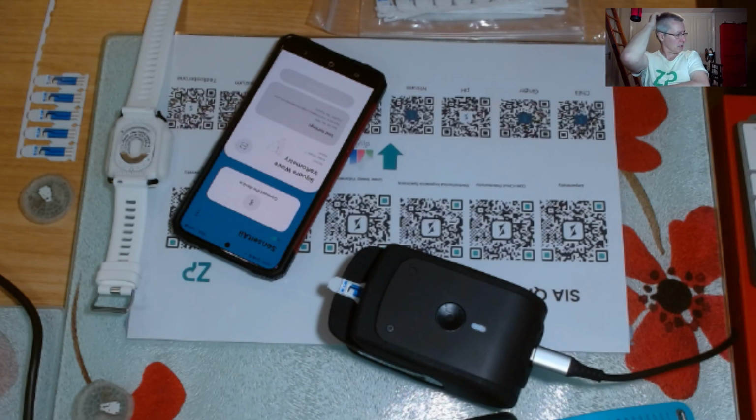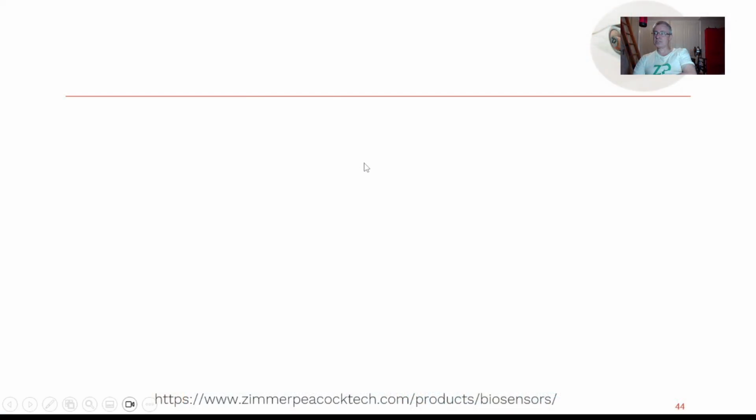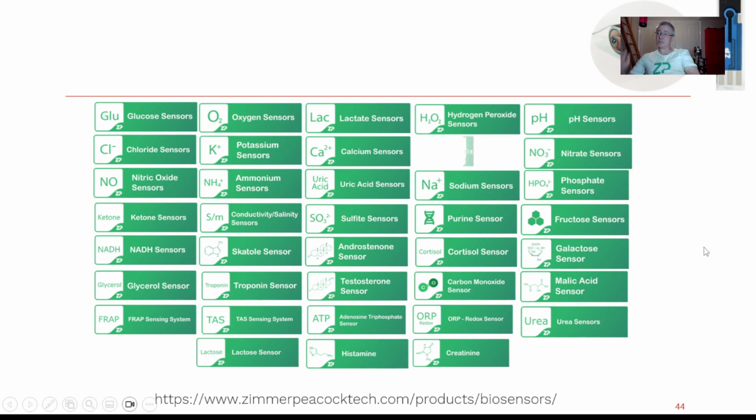If I'm doing an alcohol measurement, that measurement would be over in 2 minutes. So I'm not so concerned about fouling or biofouling at that point. If you're trying to do this inside a fermentation or bioreactor, then you are going to have fouling issues. So trying to have anti-fouling is more challenging. Now at ZP we do have a whole range of biosensors, and we do have quite a lot of experience on the alcohol sensor, but not in a 96 well format. And if you change the rules on us and said, all right, I'll put that biosensor straight in that bioreactor, I would also find that quite challenging because of the continuous mode of operation.